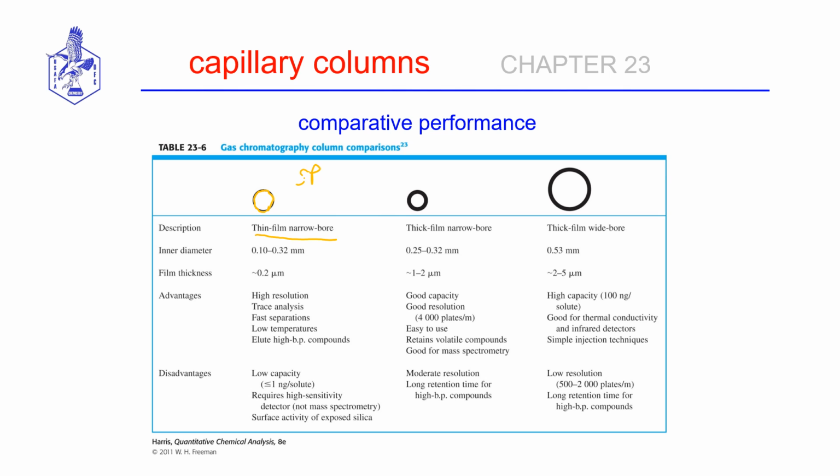The inner diameter is a maximum of 0.32 millimeters, and the film thickness is about 0.2 microns.